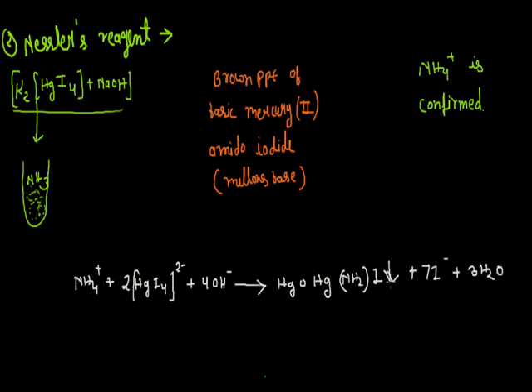So formation of this brown PPT indicates that the salt contains ammonium ion.